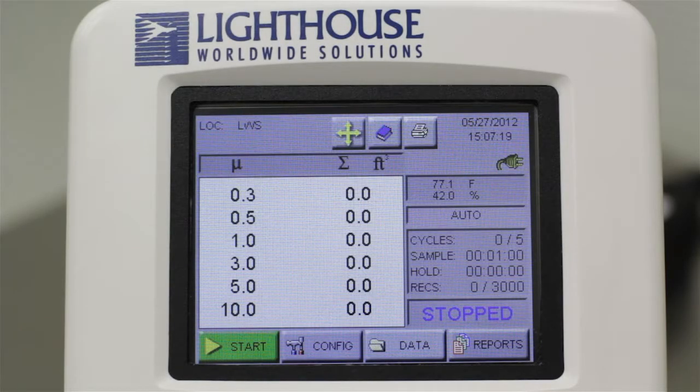To ensure you are taking the proper particle samples to meet your requirements, we will walk through the basic setup of a sample recipe. Start by touching the config button on the home screen.